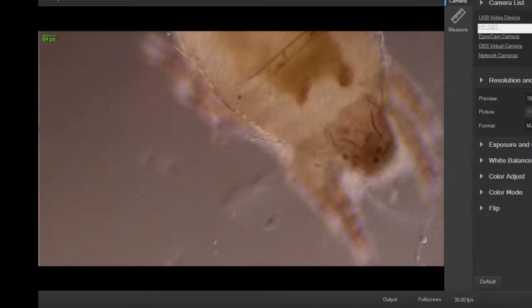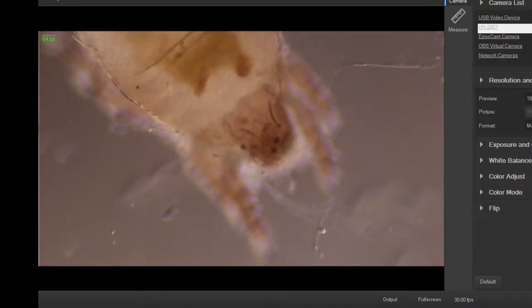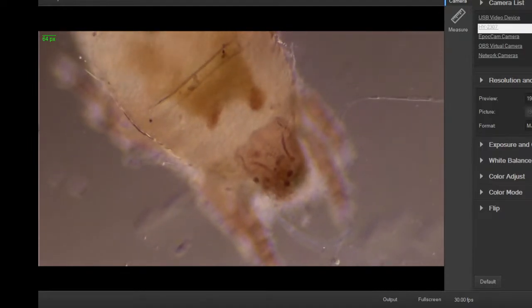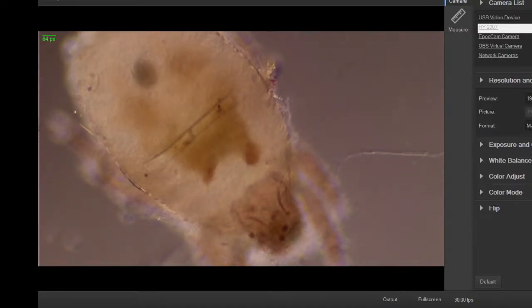Haven't found a mite in a long time. When I was doing a vet tech program for a while, deciding if I wanted to be a vet or a doctor or eventually a biologist, I used to look for ear mites, which are kind of interesting. Much more transparent than this, and a little more spiky looking. I don't remember the legs being quite as hairy. These little ear mites you'd find in a dog's ear sometimes are pretty annoying.